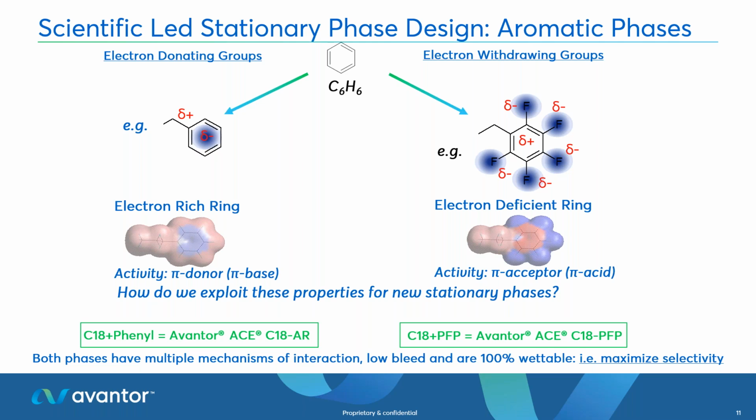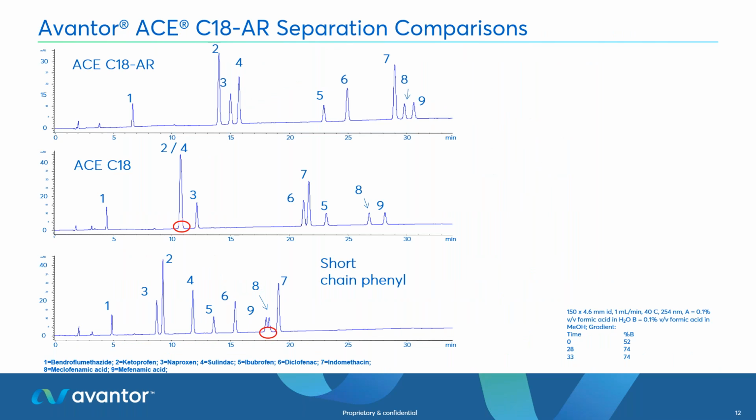It also gave the advantage that they're 100% wettable, so you can use them in 100% water because it's a more polar stationary phase than our hydrophobic fatty C18. And really what happened when we developed these was the chromatography showed both mechanisms. And here's just an example of that.